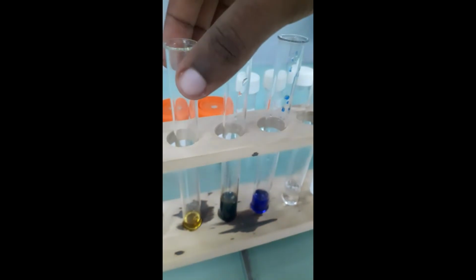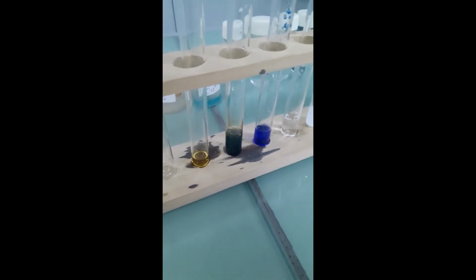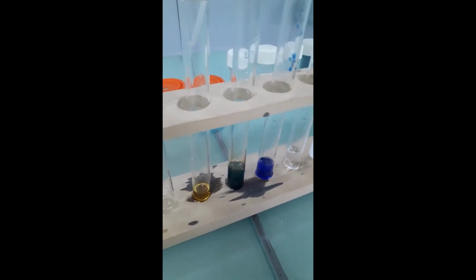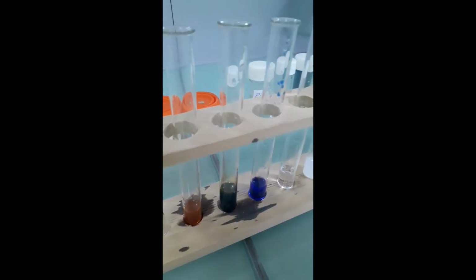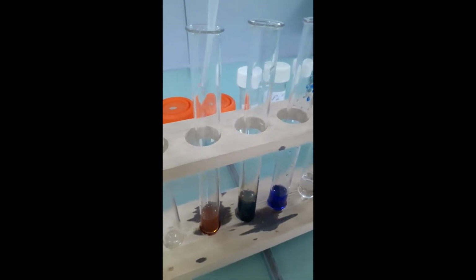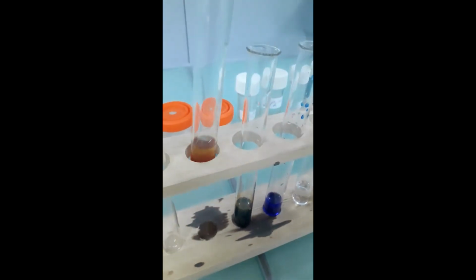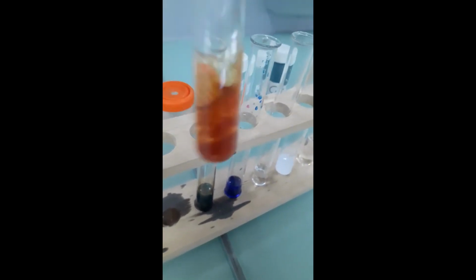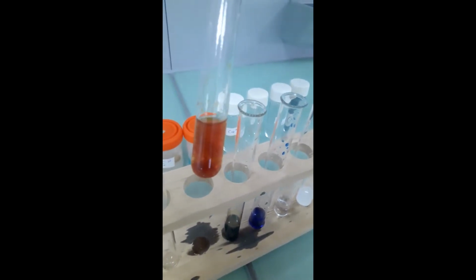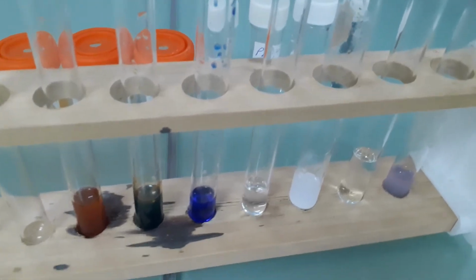And in the final test tube, there is Fe3+, and I'll be adding a few drops of dilute ammonia. A few more drops of dilute ammonia. So there you have it. Reaction of your cations with ammonia solution.